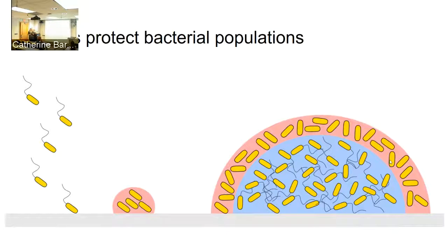And right now, we don't have a way to separate every single subpopulation in UTI-89, so we're focusing on the two that we are able to separate just through a physical washout, which is this matrix subpopulation, which is the external film-like portion of the biofilm. This has a lot of the structural components, the curli, that provide cell-to-cell adhesion and also cell-to-surface adhesion, so they kind of hold the population together and protect it. And this we're calling the matrix fraction or the matrix subpopulation. I'll probably refer to it both ways throughout the talk.